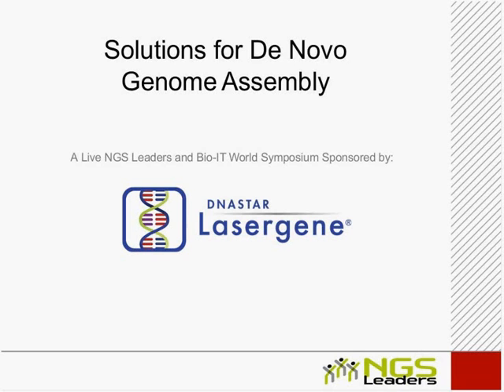As you embark on complex genome projects, what are some of the key considerations in terms of, for example, DNA library preparation or performing pilot sequencing projects before you get the main project underway, algorithm evaluation, IT, storage requirements? These are just some of the key factors that you'll have to consider if this project is going to prove to be a success.